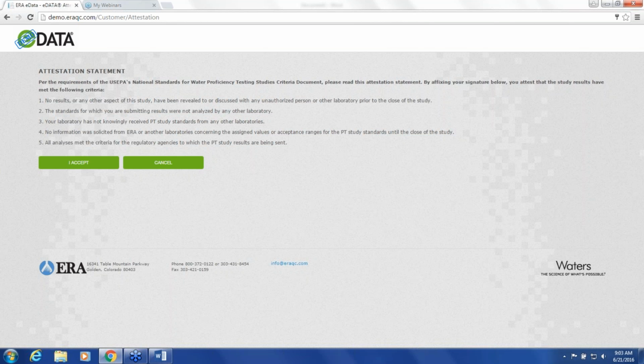I think you will find our data analysis tools helpful in identifying improvements your company can make to help you and your customers be more confident in your lab's results. The purpose of today's webinar is to demonstrate how to use advanced reporting tools such as Health of Your Lab, Performance Report, and Exception Reports to identify opportunities for improvement, use the PT Review to identify accreditation risks across your entire lab network, and use the Risk Report to identify any potential problems before failures occur.